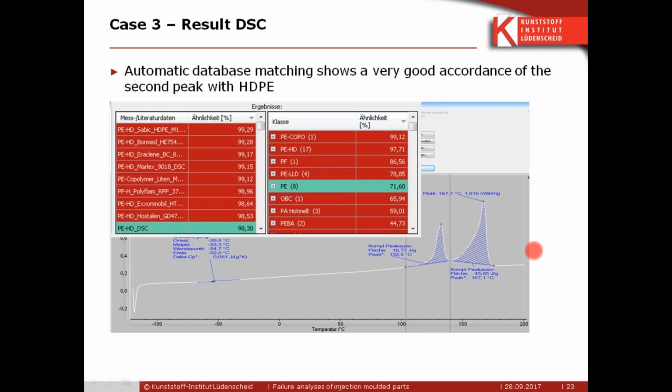Okay, another question, that would be one for me. Identify database. How does the Identify database work with the Proteus software? So that's just maybe a configuration thing. So I say all the latest software, including the one for DSC Polymer, they include the Identify algorithms.